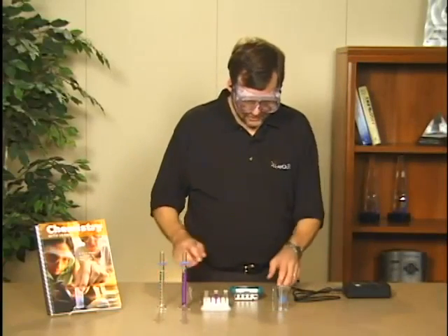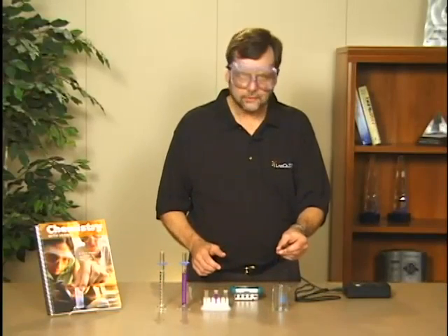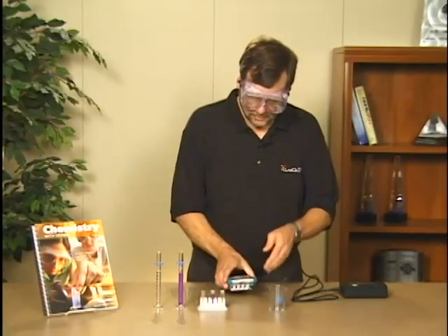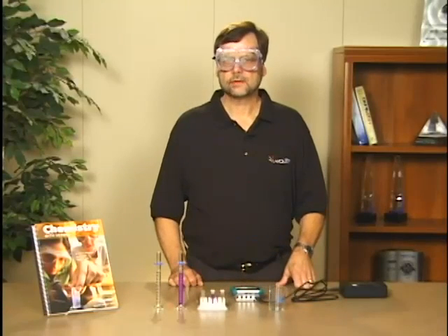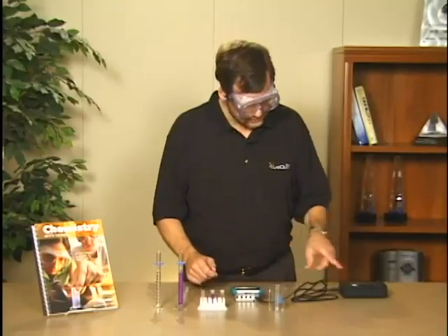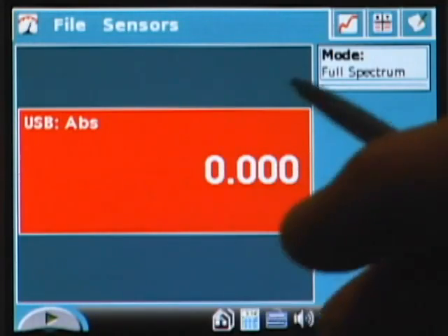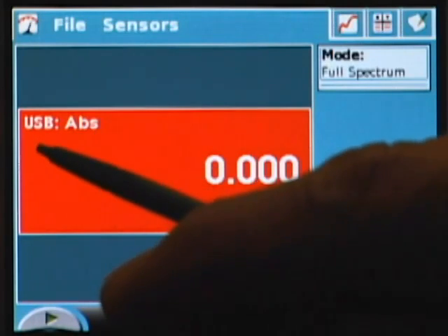To start, I'm going to connect the SpectroVis, which has a USB output, to the USB port on the LabQuest. I already have the LabQuest turned on, and as soon as I connected it you can see that the SpectroVis has been identified by a red meter that appeared, indicating that absorbance is being measured on the USB port.